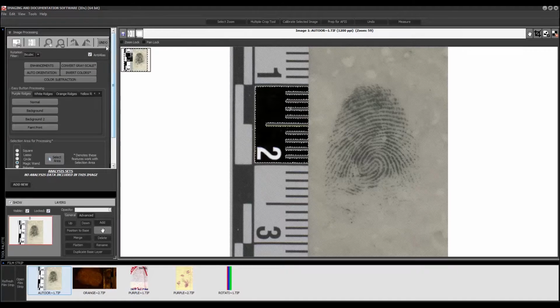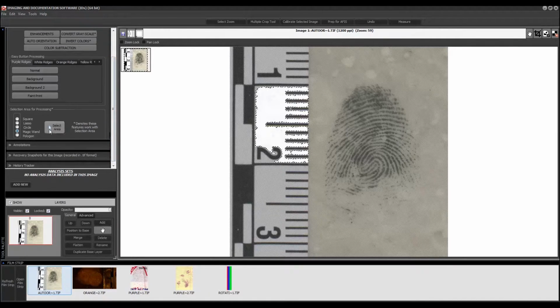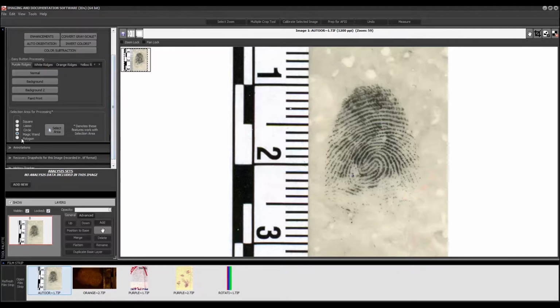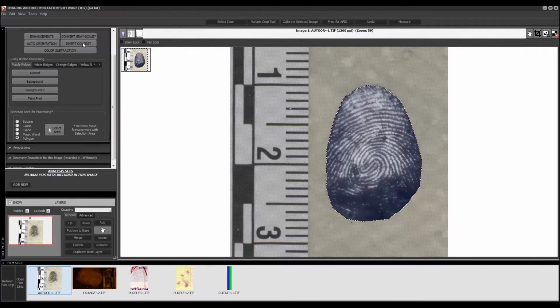If you wanted to get out of any specific area selection, you can just click anywhere in the image again and it will, excuse me, I still have it selected. You can just click anywhere in the image and it'll undo it. There I just clicked on the select image tool because every time I kept clicking I just kept making more selections, but you can just click off the image and it'll take that off as well. The polygon tool allows you to make multiple clicks, and then as soon as you are done you can double click, and double clicking will end that. So here's my double click. So that makes my selection, and same thing in those selected areas I can do things like inverting the colors. All right.